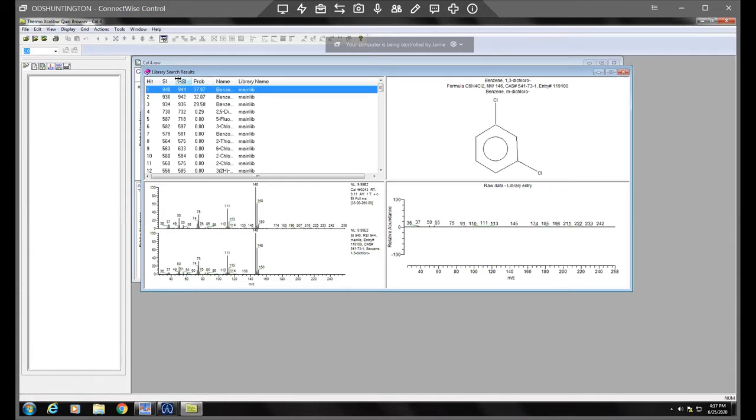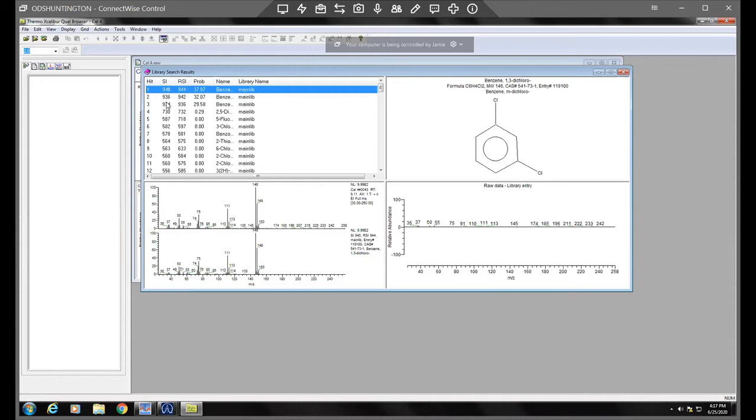You actually want to look at the SI and RSI values and if the SI and RSI values are at least above 800 to a thousand or so, that's a good match. So the higher, the better. Especially if both values are high, then you definitely can trust that it's a good match.